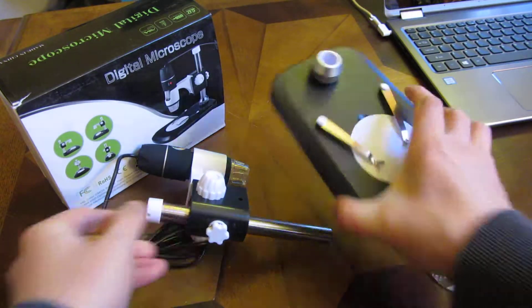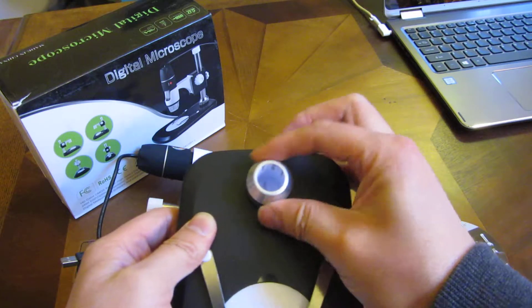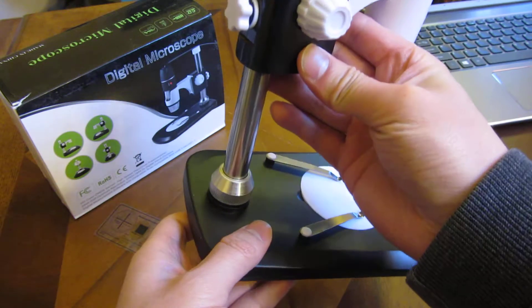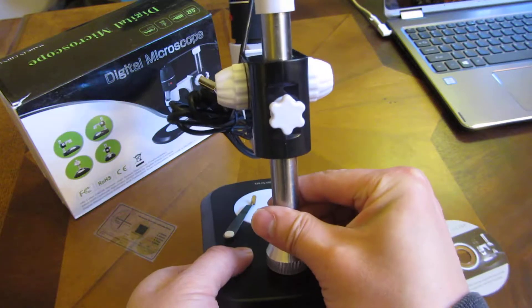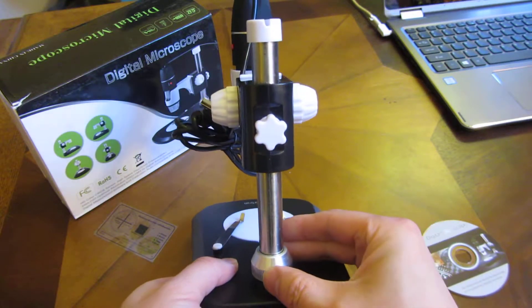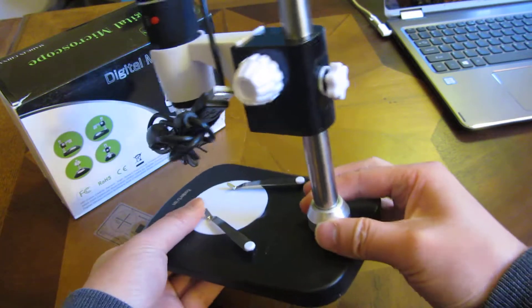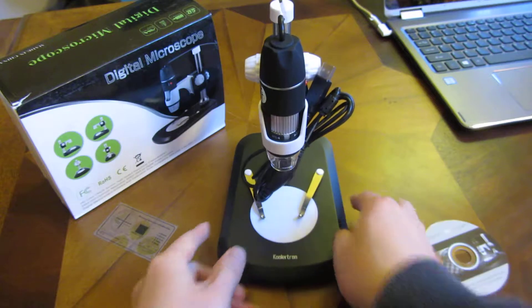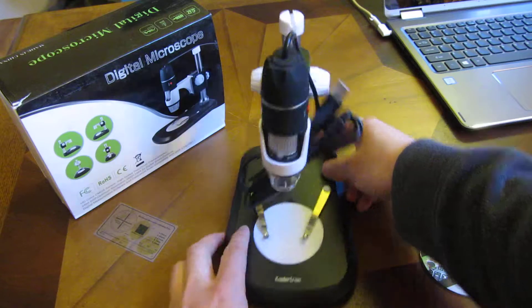To attach to the base, you simply turn this loose. I'm going to turn the base loose here, and now I can insert this tube into this base and simply tighten it by turning it clockwise. Now I have the camera itself in place — and that was a quick assembly.